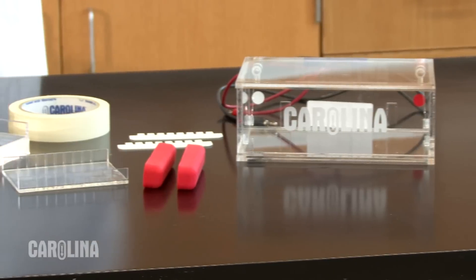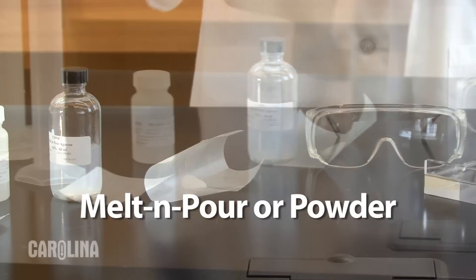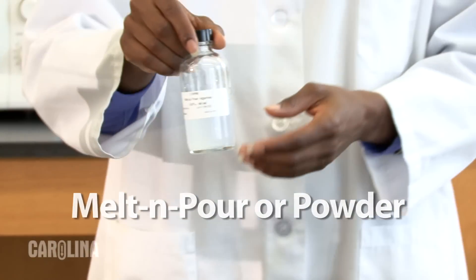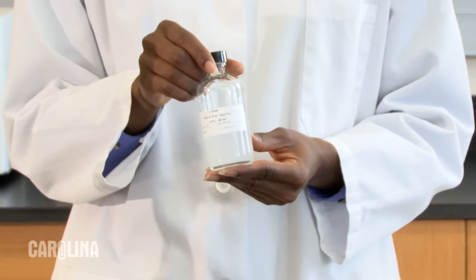Carolina kits come with two different forms of agarose: melt and pour, and agarose powder. With melt and pour agarose, the agarose has already been dissolved and buffered. All you need to do is melt it.